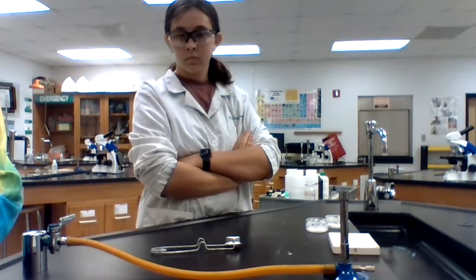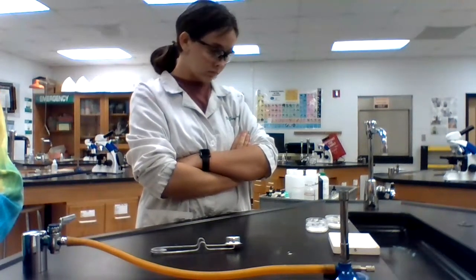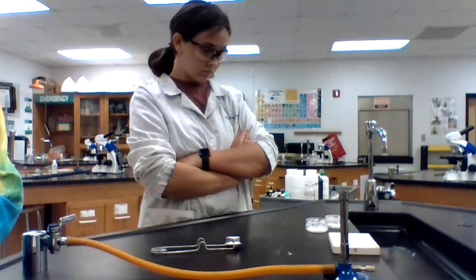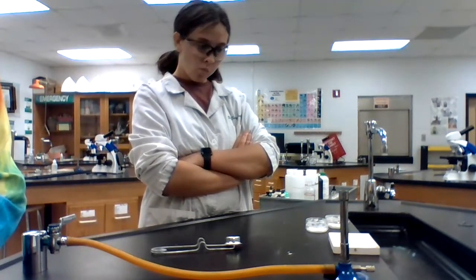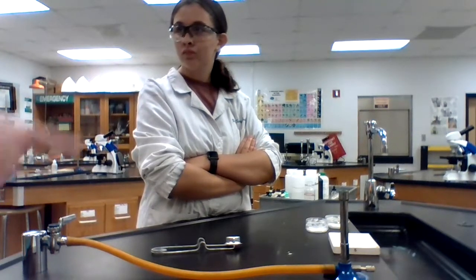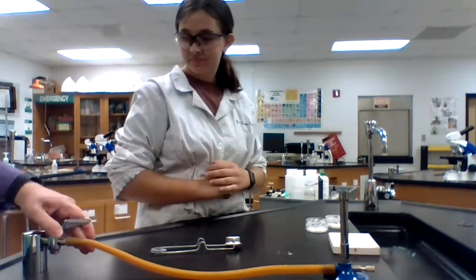So what we're going to do first is we're going to test our known substances, and then we're going to test an unknown. And based on the results of these tests, you will then come up with your conclusion to your hypothesis. So we're going to start off by lighting our Bunsen burner.